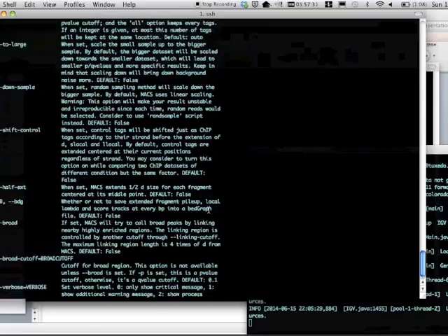So we are specifying all these different arguments, and we will send the output of the peak caller to the macs out directory, just to avoid the clutter, because there are so many files being created in this process of following a pipeline to process, in this case, ChIP-seq. But this really applies to all high throughput sequencing data. It's better to keep the outputs of all these tools in separate directories to avoid clutter and to find things a lot more easily later.